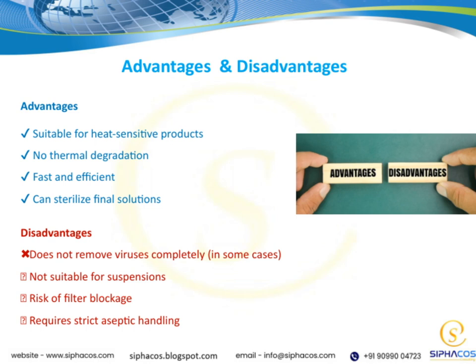There's also a risk of filter blockage, which can disrupt the process and require additional maintenance. Lastly, it requires strict aseptic handling, meaning that careful procedures must be followed to avoid contamination, adding a layer of complexity. Overall, understanding these pros and cons helps us decide when this method is the right fit within our broader sterilization strategies.